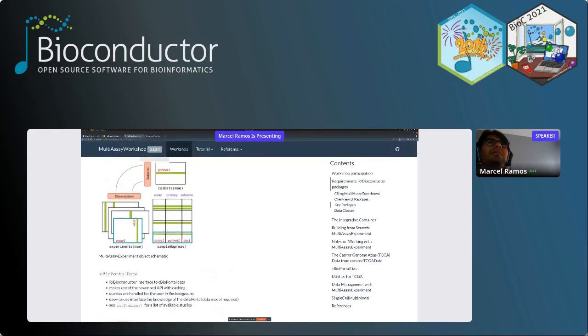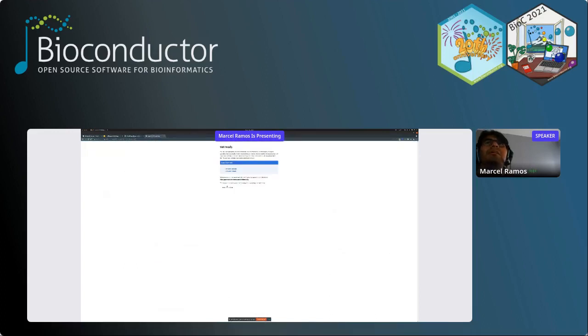So let's check on our workshop and see if it's done. So it looks like for me it's ready. Please don't look at my link. Otherwise you'll boot me off.